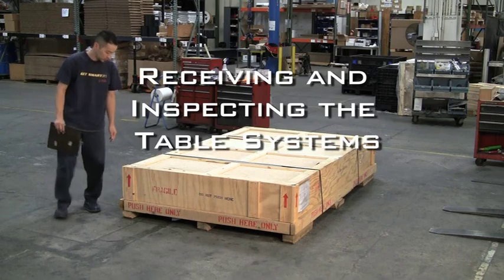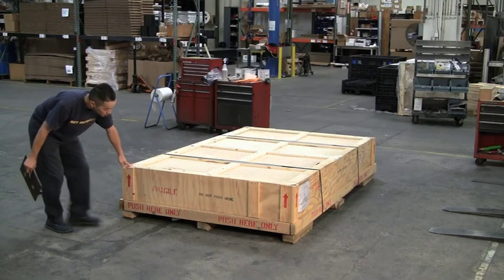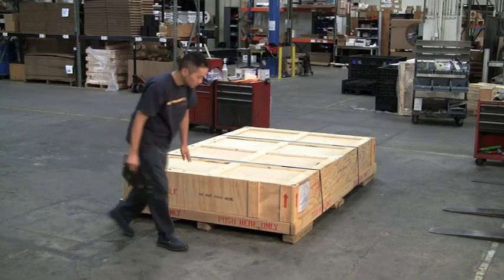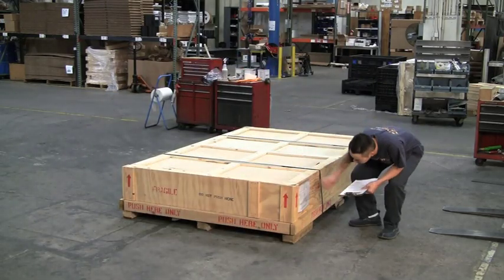Receiving and Inspecting the Table System. After receiving your table system, carefully inspect the table crates for any shipment damage or mishandling, and document any potential issues with notes and photos.